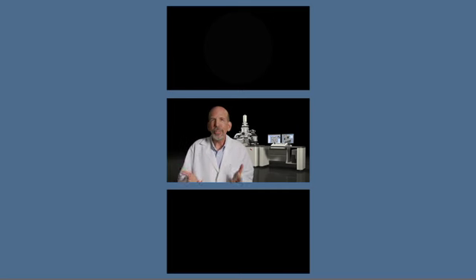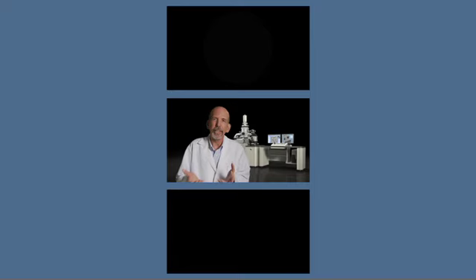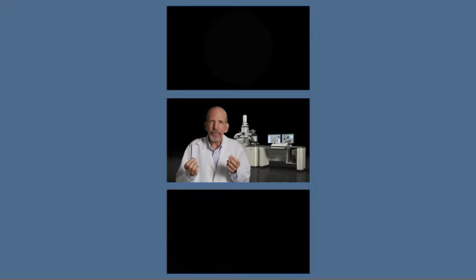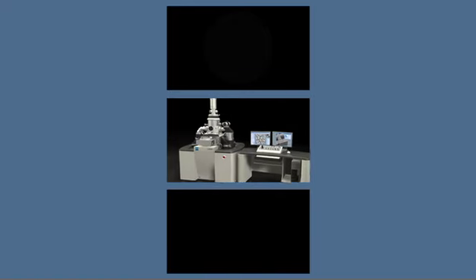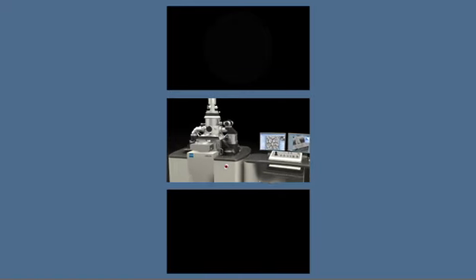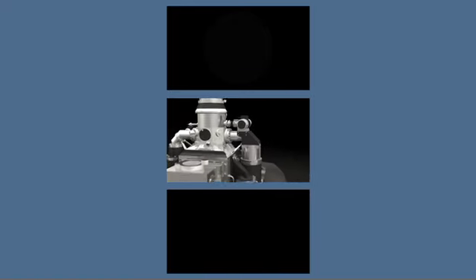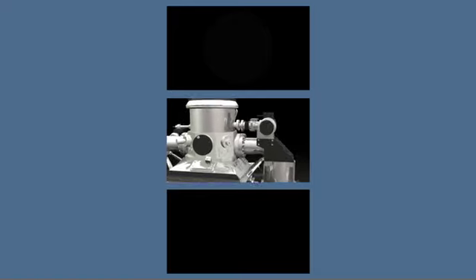Welcome to a world that expands the boundaries of imaging and pushes the theoretical limits of resolution. A world that is brighter and sharper and more revealing. A world where it is simpler than ever for scientists to see what they must see so they can solve what they must solve.